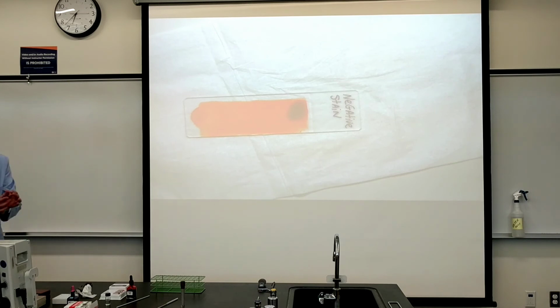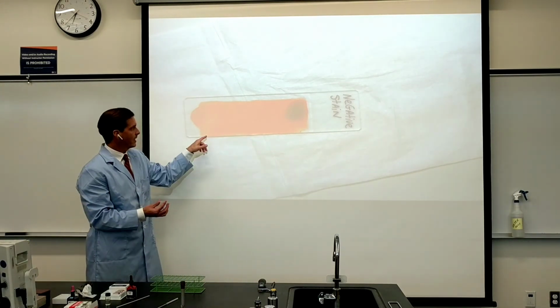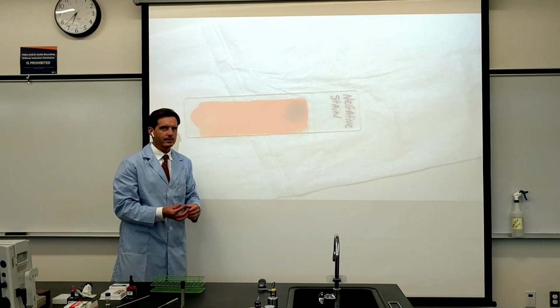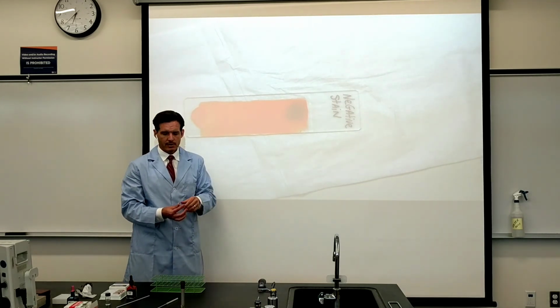and then you reverse it right across as you feather it across to make a smear. Now, I was a little shaky, and I did get some towards the bottom edge of the slide here. But we're going to let this air dry, and they're harmless oral bacteria, so I'm just going to say that this is going to be usable, all right?